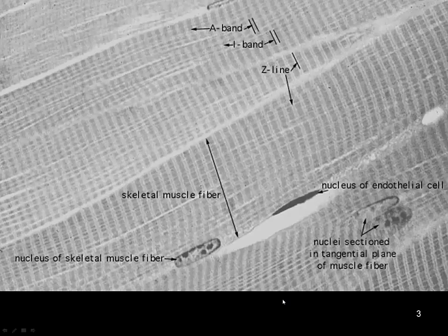But the other reason that I'm calling this skeletal muscle is look across the muscle cells. Follow this I band. It's almost practically straight all the way down. Even over here, as we follow this across cells, you can see how really regularly aligned they are. And so that regular alignment across muscle fibers is why I call this skeletal muscle, and it is in fact skeletal muscle.